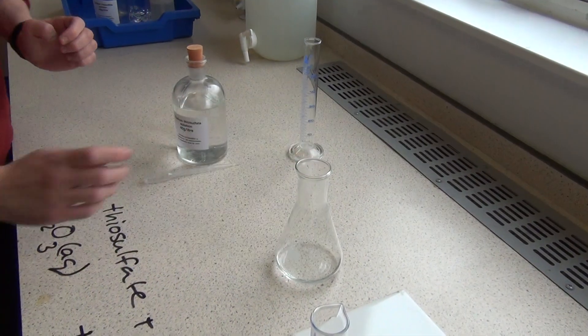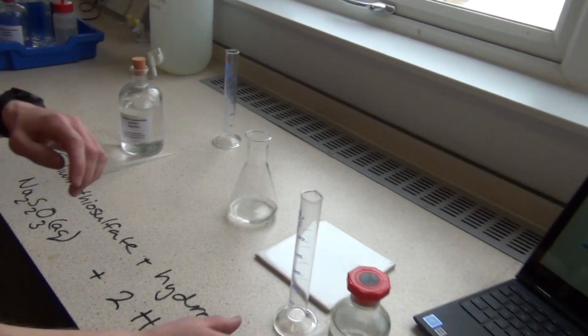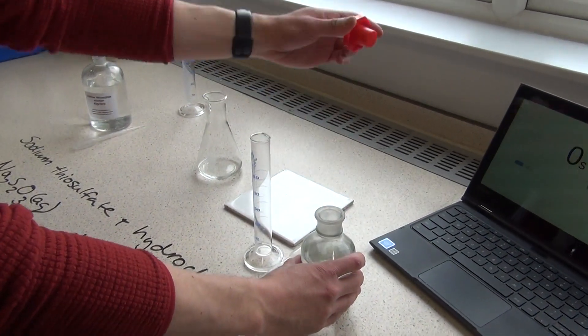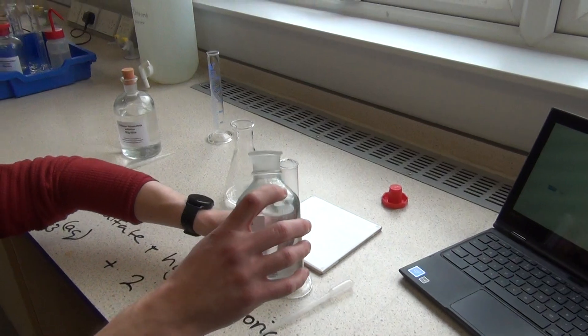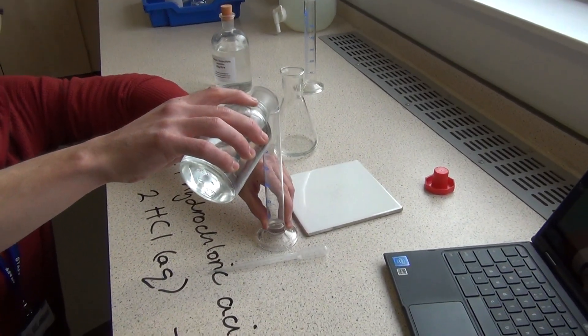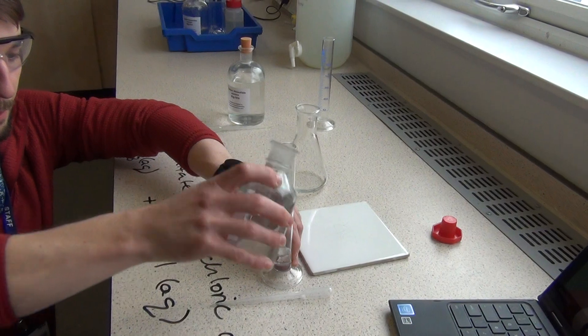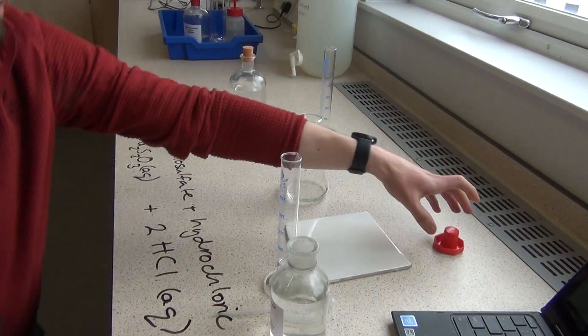Okay, now, next up, I need to react this with hydrochloric acid. I need less of this, I only need about 10 centimeters cubed. Don't worry too much about the quantities in exam questions, as long as you state a quantity and state that you're going to control it. Okay, bang on there, 10 centimeters cubed.